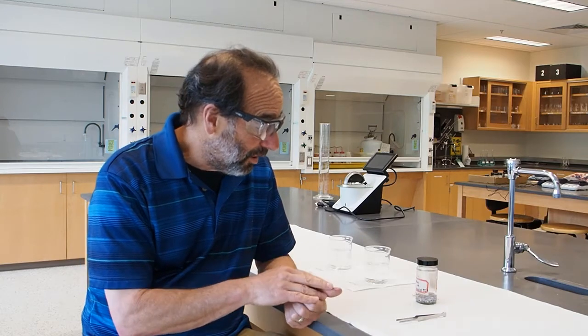What we're going to do is look at a series of metals: sodium, magnesium, zinc, and copper. We'll look at progressively more and more aggressive reagents for trying to get those to dissolve. Then we're going to look at gallium, which is in group 3A or group 13, and try to figure out what dissolves it. That is a more exploratory portion of our endeavor, in that I don't know what will dissolve it or not dissolve it. I've never actually tried to dissolve gallium.